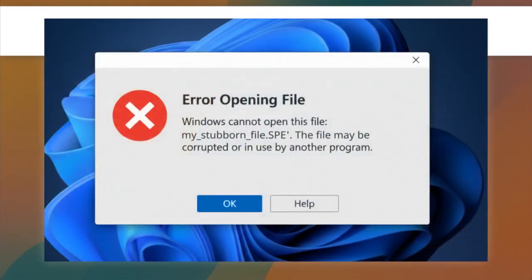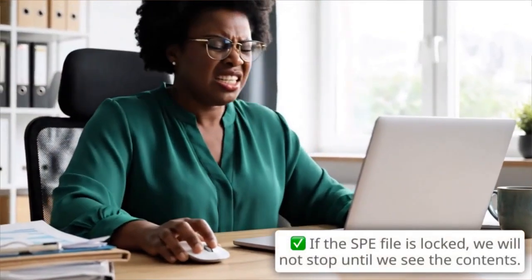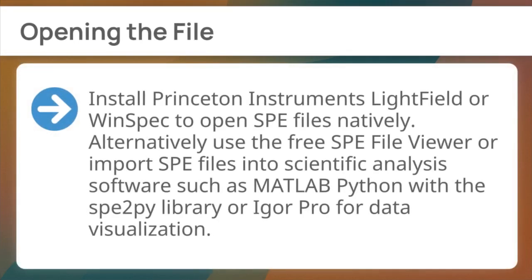Dealing with a truly persistent SPE file, let's execute these quick diagnostic tests on the most likely points of failure. First, opening the file. Install Princeton Instruments LightField or WinSpec to open SPE files natively. Alternatively, use the free SPE File Viewer or import SPE files into scientific analysis software, such as MATLAB, Python with the SPE2PY library, or Igor Pro for data visualization.